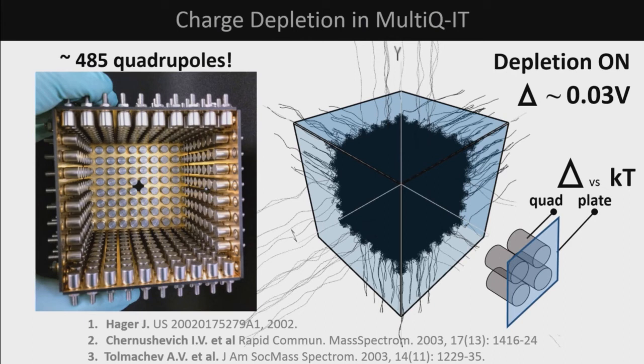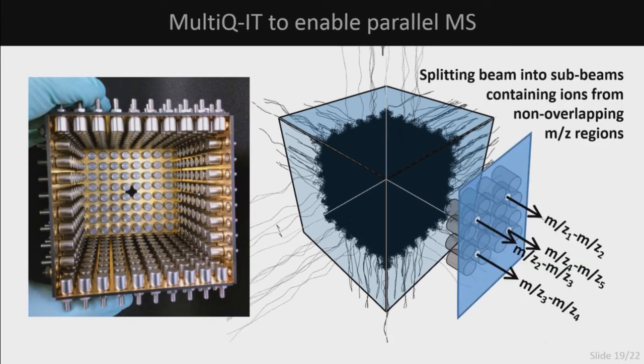And that multiplies the effect to the point where we observe it in real time as ions enter and exit the device. If you allow me to compare this to something that already exists, I would draw a comparison to online dialysis. Here, however, we can control the pore size by simple electrical potential. But our ultimate goal is to use the multiple ability of ions to exit through the quadrupoles.